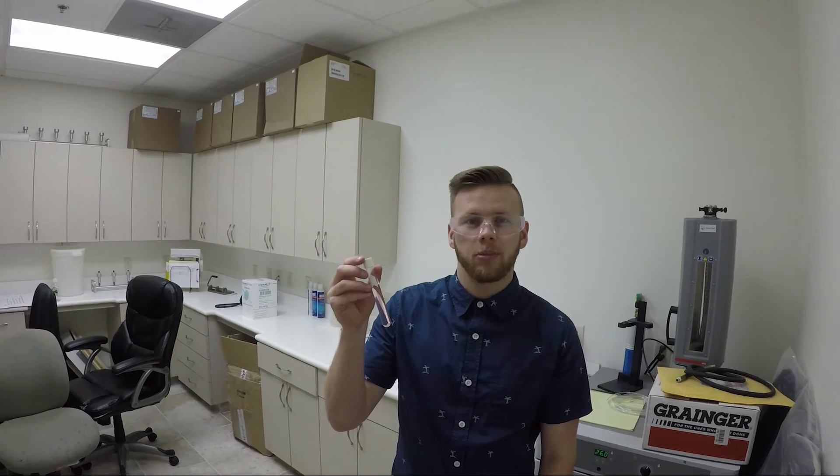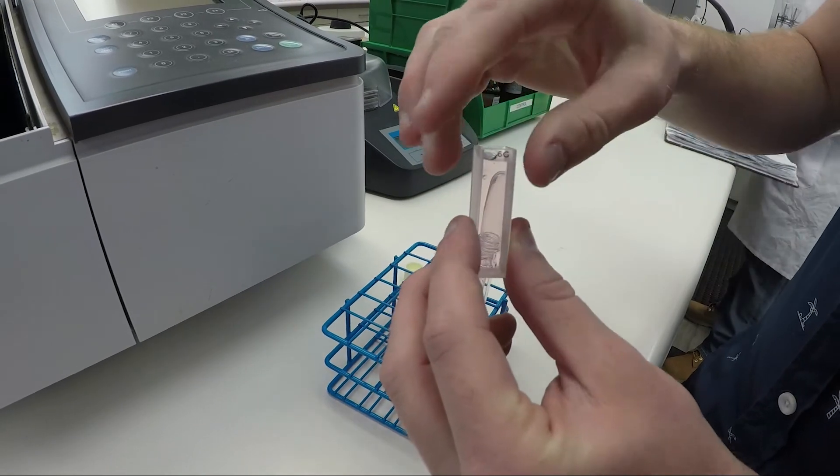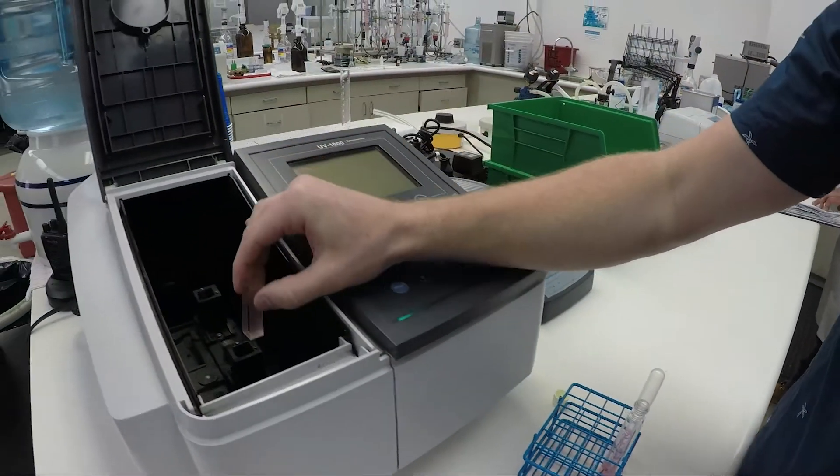After the incubation, we'll read our samples on spec and record the data.